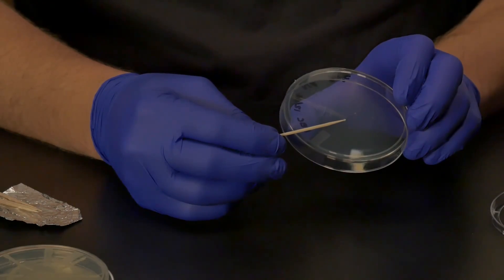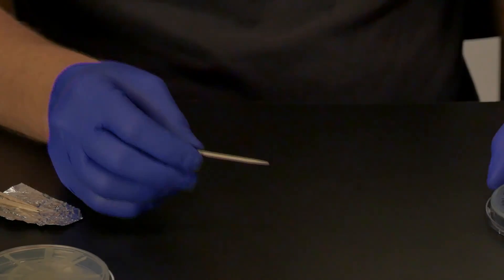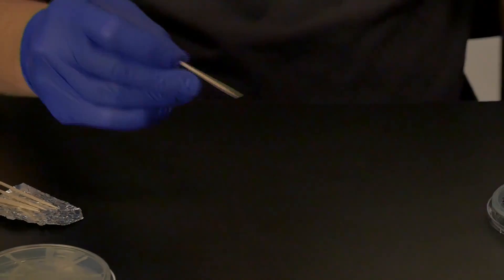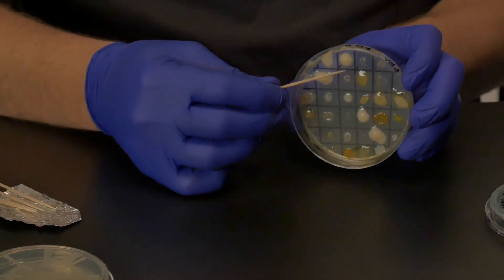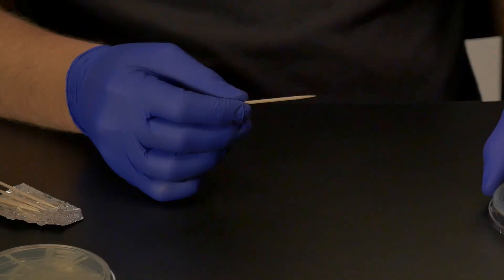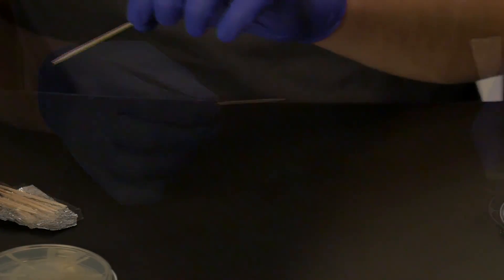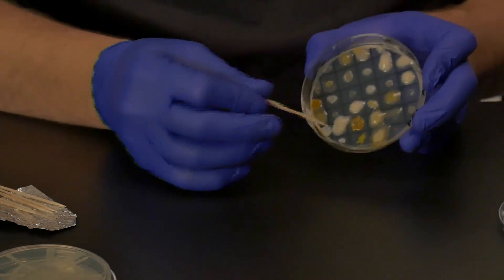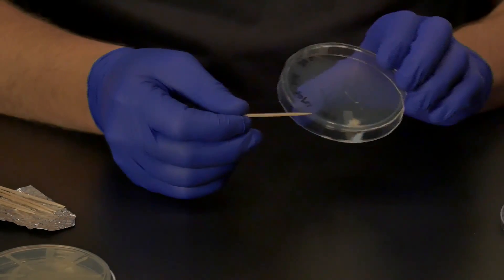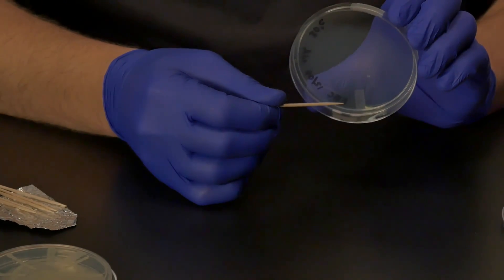Finally, using a sterile toothpick, choose the colony that has shown a zone of inhibition which you are trying to prove on this plate. Touch the top of the colony and transfer it to the new plate, placing a sample as close to the hub of the wheel as possible. Then drag the toothpick towards the edge of the plate and through the line of pathogen you have previously made. Do this again at a different spot on the plate as a replicate of the first one. Replace the lid, turn the plate over, and incubate.